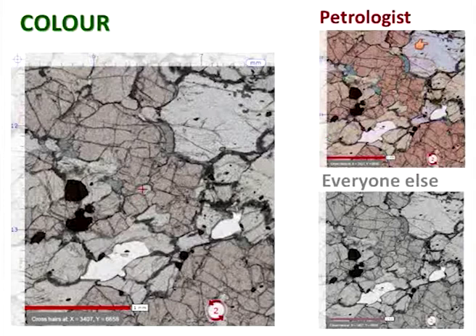Then you can start to see a sort of lilac pale blue mineral up here, other minerals that are a very dull greenish colour, and the garnet comes out as very definitely pink. And then there's a blue mineral here, a fringe of really quite rich blue, and even a patch of dark green over there.